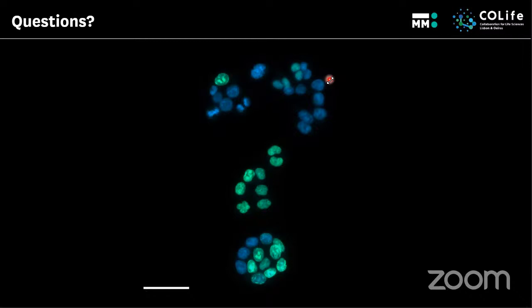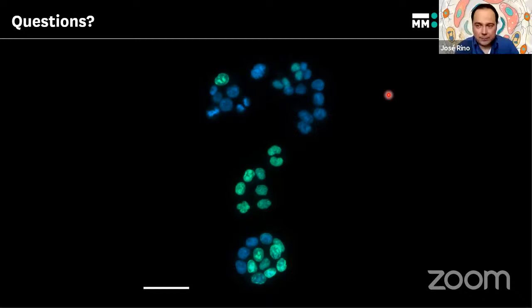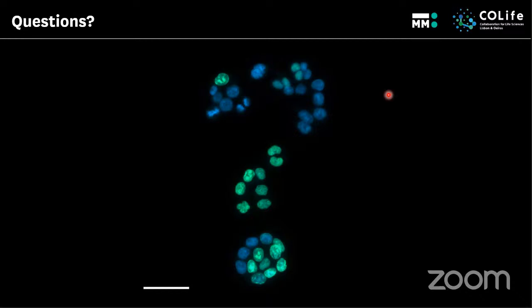While we are using the confocal microscopy to visualize the motion of the lymphocytes, as you saw in the diagram, it was a little bit blurry. So what was the reason? You're talking about the spinning disk compared to the point scanning. Yes.